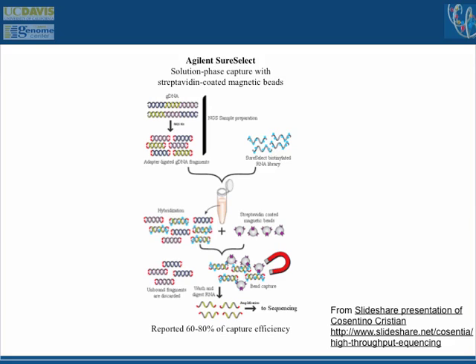Yeah. What about like AFLP or something for this as a way to chop things up before? You mean to try and identify a region of the genome to do, or? Well, no, it's just you're talking about like ways so that you could potentially do more samples in one run. So the AFLP might be a way of screening samples, right?